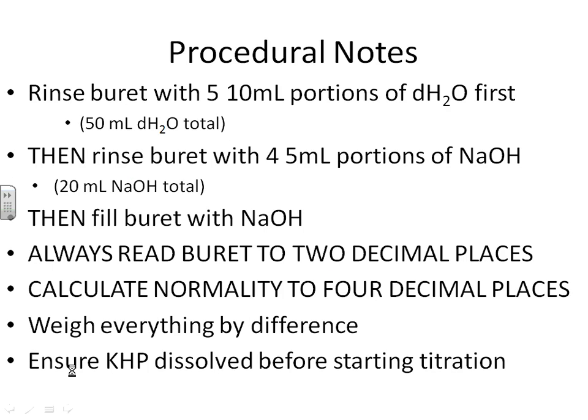A few notes about the procedure. Again, I'm going to leave these slides up so that you can refer back to them when you're going through your calculations. I will reiterate these procedural notes on the day of the lab, but I do want to make you aware in advance. You're not going to come in, fill your burette, and start titrating. This has to be a very precise lab procedure.